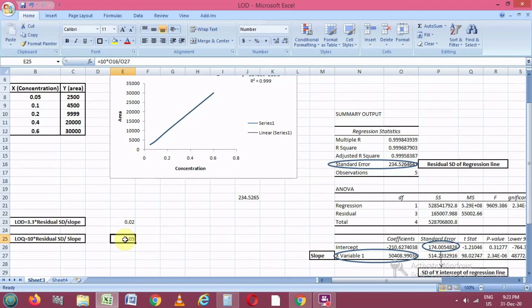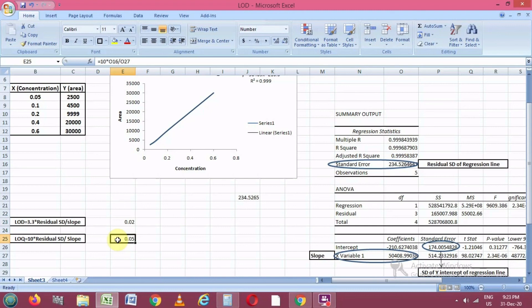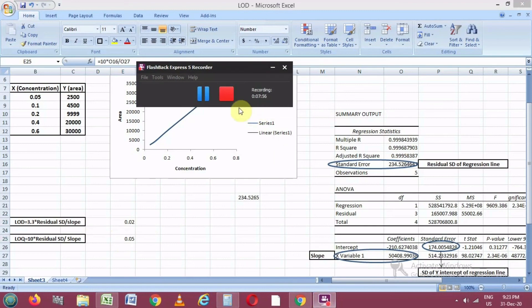Similarly, we calculate the LOQ value: 10 multiplied by the residual standard deviation, divided by the slope value. Selecting these values and entering the formula gives us the LOQ result, which will also be converted to two decimal places.